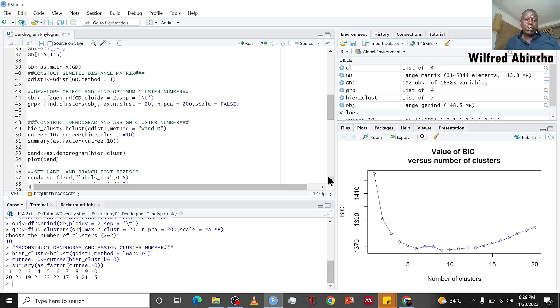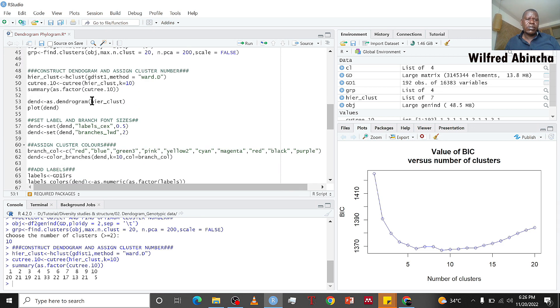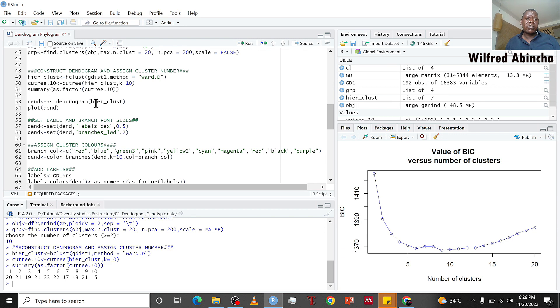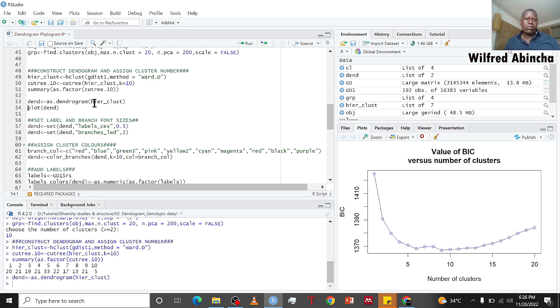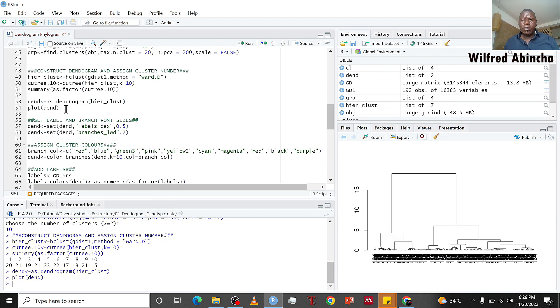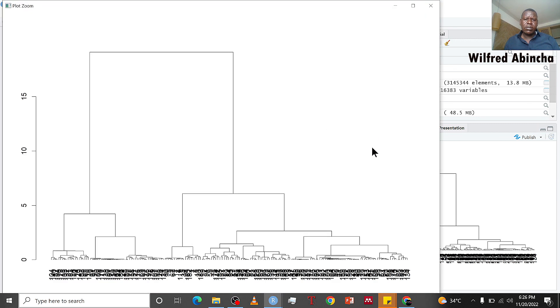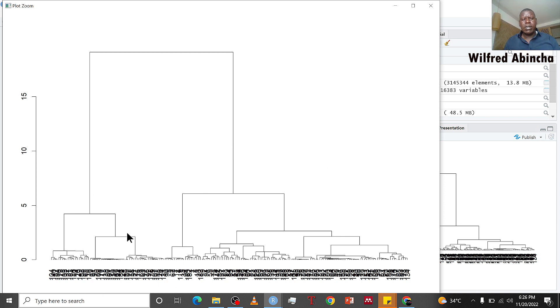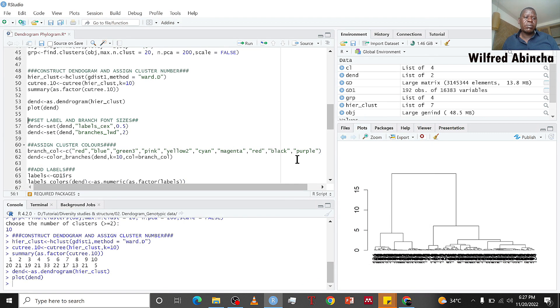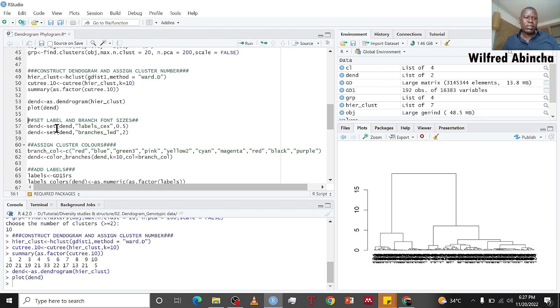The next thing we do now is to construct this hclust as a dendrogram. After clustering, we construct it as a dendrogram using as.dendrogram function. Then you plot the dendrogram. This is our dendrogram that we have constructed from our marker data, but remember we need to put the labels here because in our data we removed the first column which was having labels.